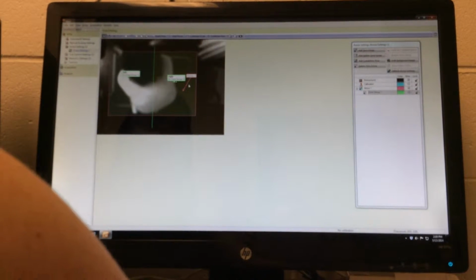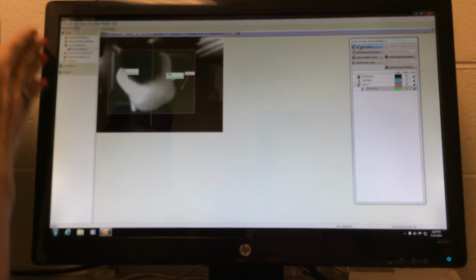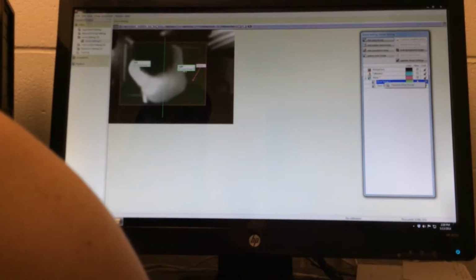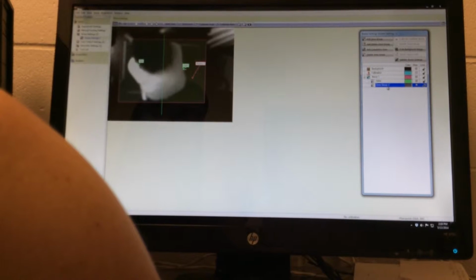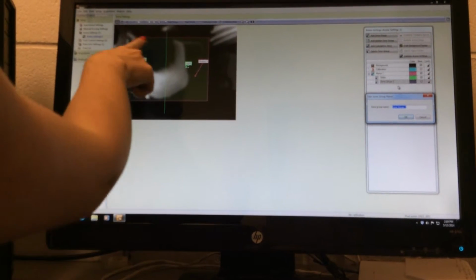And there we go. I can also add another zone group. So let's say I want to know when they're on the left or the right, but then I also want to know, so I can rename that and call it sides. That's fine. And then let's say I also want to know whether they're in specific points within here.